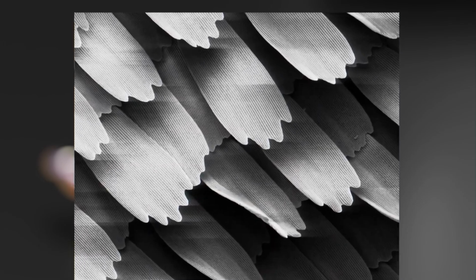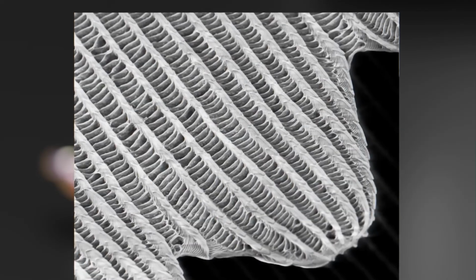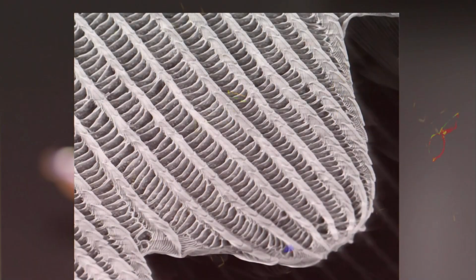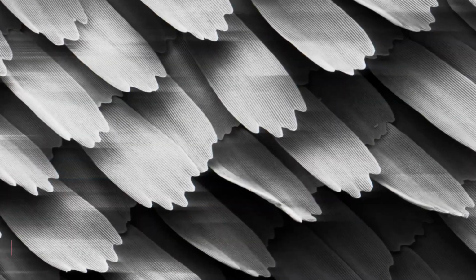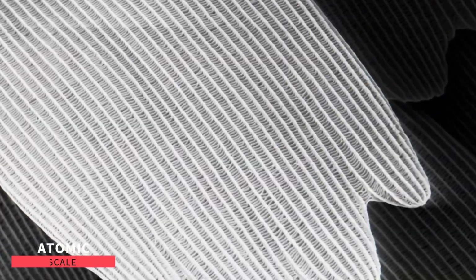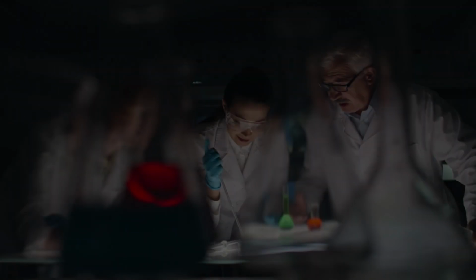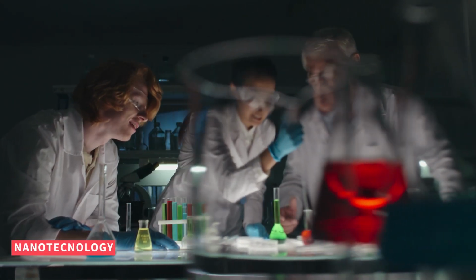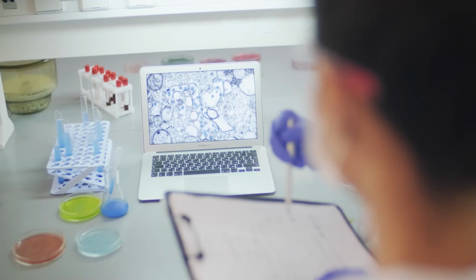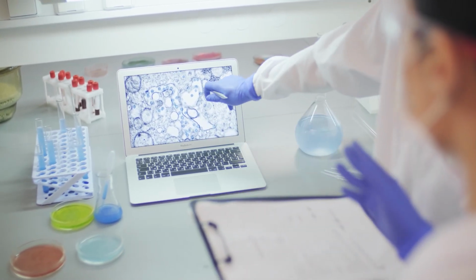One of the key advantages of electron microscopes is their incredible resolving power, the ability to distinguish between incredibly small features. While traditional light microscopes are limited by the wavelength of visible light, electron microscopes can achieve resolutions down to the atomic scale, revealing details that would be impossible to see with any other imaging technique. This incredible resolving power has opened up new frontiers in fields such as materials science, nanotechnology, and structural biology, allowing researchers to study the fundamental building blocks of matter with unprecedented clarity.